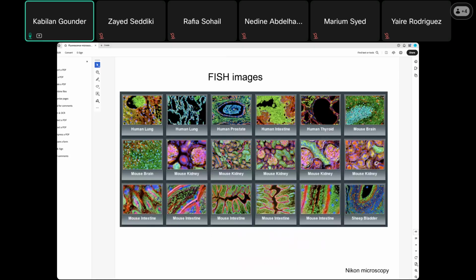So this is Nikon microscopy data using different techniques, and how the fluorescence helps to understand not only just the target protein but also the organ or cells as a whole which express it. Some genes or proteins are ubiquitously expressed. If you target that protein, then the whole organs or cells will be expressed.